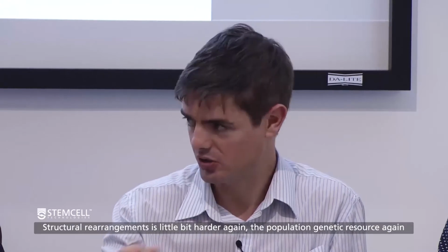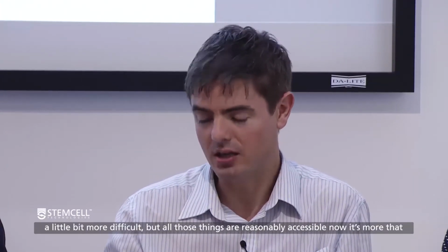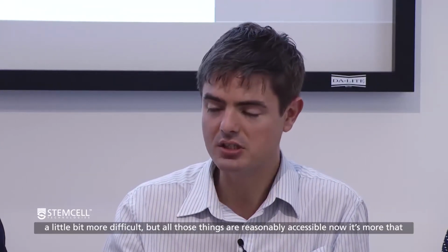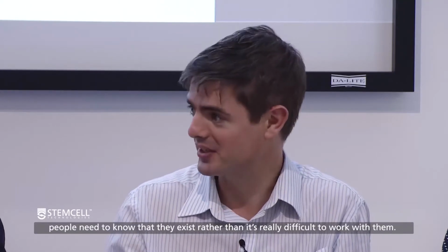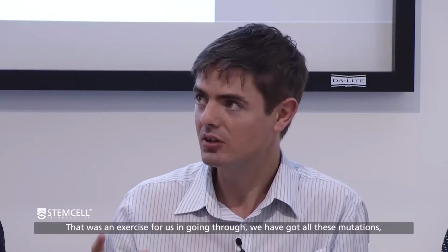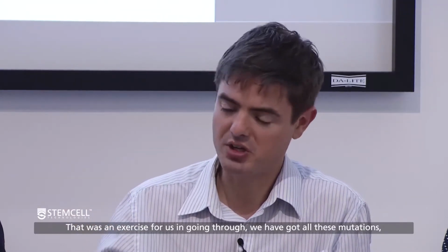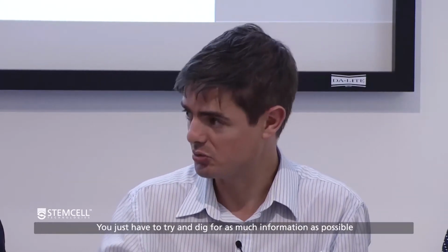The kind of population genetic resource, again, is a little bit more difficult. But all of those things are reasonably accessible now. It's more that people just need to know they exist, rather than it being really difficult to work with them. That was an exercise for us in going through it: right now we've got all these mutations, how do we classify them? And there's no one way to do it. You just have to try and dig for as much information as possible. Sure, sure.